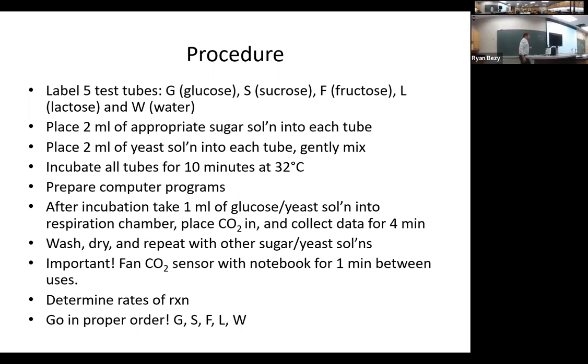You're going to put all of those tubes for 10 minutes at 32 degrees Celsius. So this is my water bath over here. Looks like it's running maybe a little hot at the moment, but it's fine. So you're going to put them in there at 32 degrees Celsius. You're going to keep it there for 10 minutes or so. Prep up your computer programs.